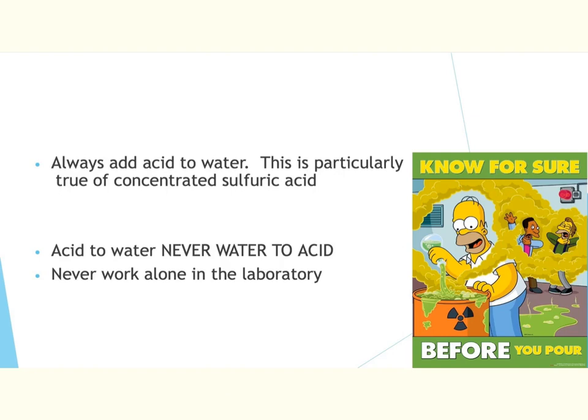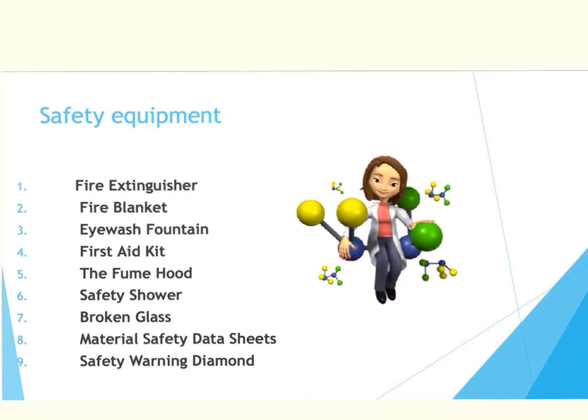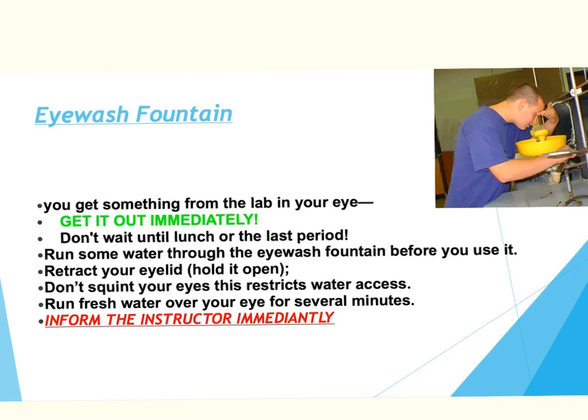You are never allowed to work alone in the lab. You need to have an instructor present at all times and preferably a lab partner as well. It is also extremely important for you to be able to identify the locations of the following safety equipment in your lab: the fire extinguisher, the fire blanket, the eyewash fountain, the first aid kit, the fume hood, the safety shower, where broken glass should be placed, your material safety data sheets, and your safety warning diamond. All of this should be easily identified — you should be able to draw out your lab and locate each of these components.